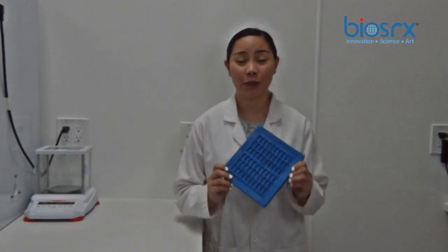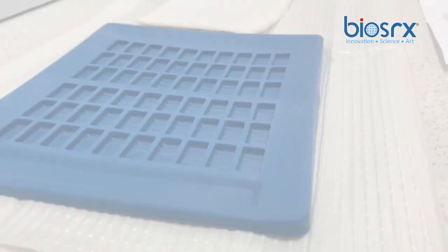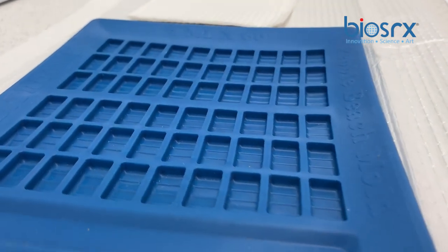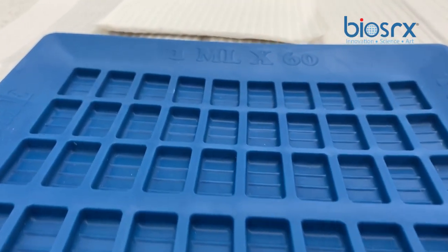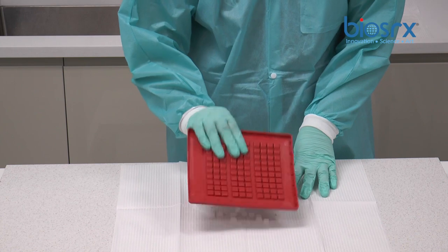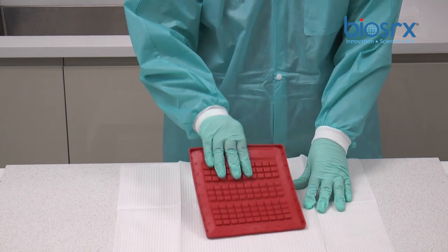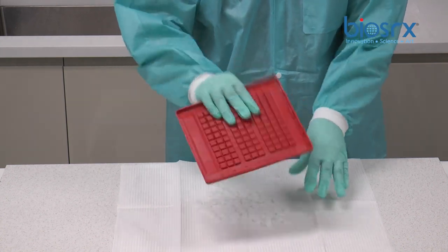BiosRX also carries a one-milliliter mold that is triple-scored and can hold up to 240 milligrams of active pharmaceutical ingredients. The benefit of scoring the trochees allows titration of medication therapy and fine-tuning of dosing. In other words, this mold is ideal for making LDN trochees.